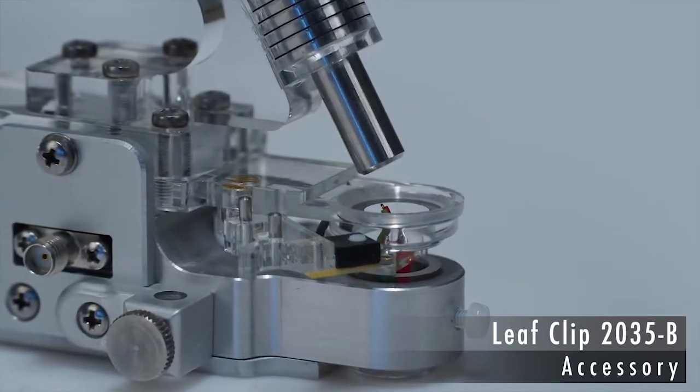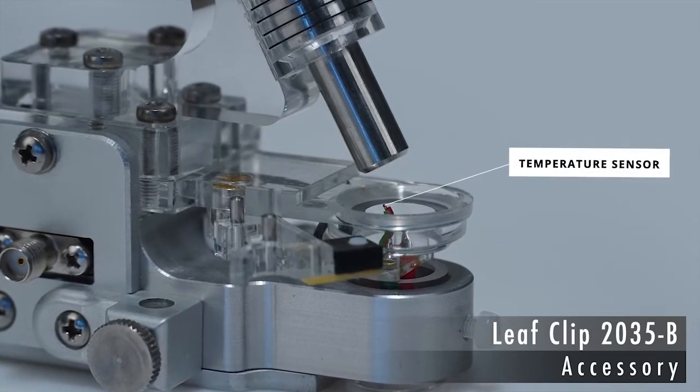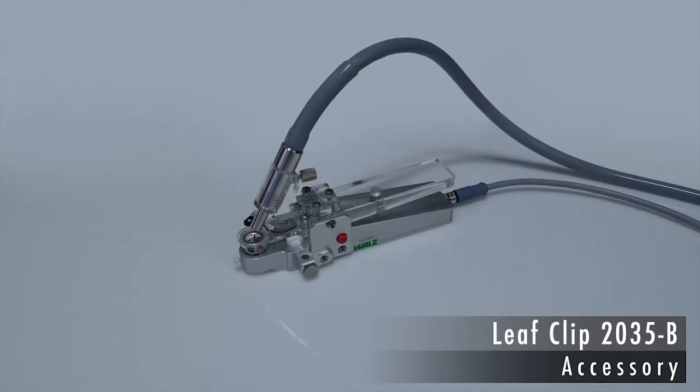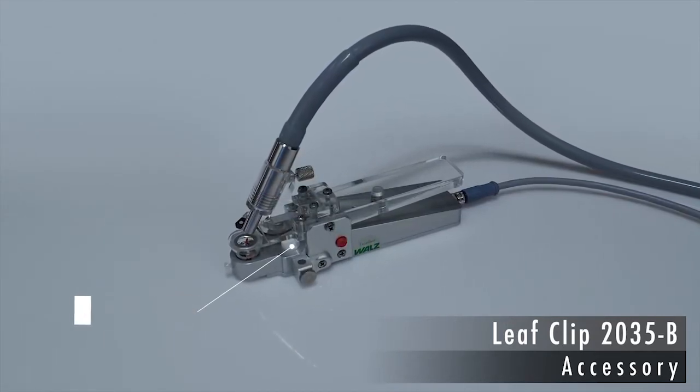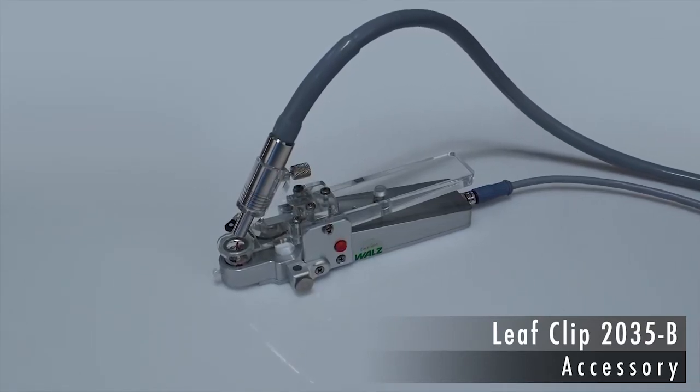At the same time, the temperature of the leaf is measured using a thermocouple. The field clip also features a humidity sensor to monitor air moisture. Air moisture affects leaf photosynthesis by modulating stomatal opening.